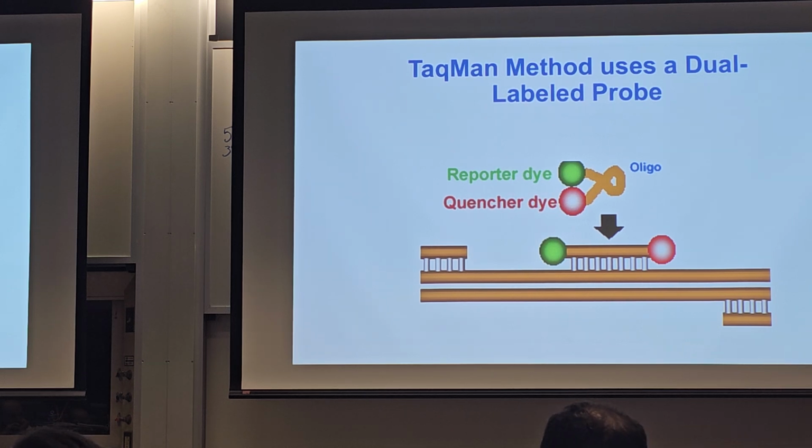And in the end, we're going to show you that because our primers are so good, it doesn't matter which one you use. So if you're in the SYBR Green lab, don't feel like you're getting shortchanged. Your results are going to be just as good as the TaqMan one. The reason we're doing both is we want to show you that they both work, okay?